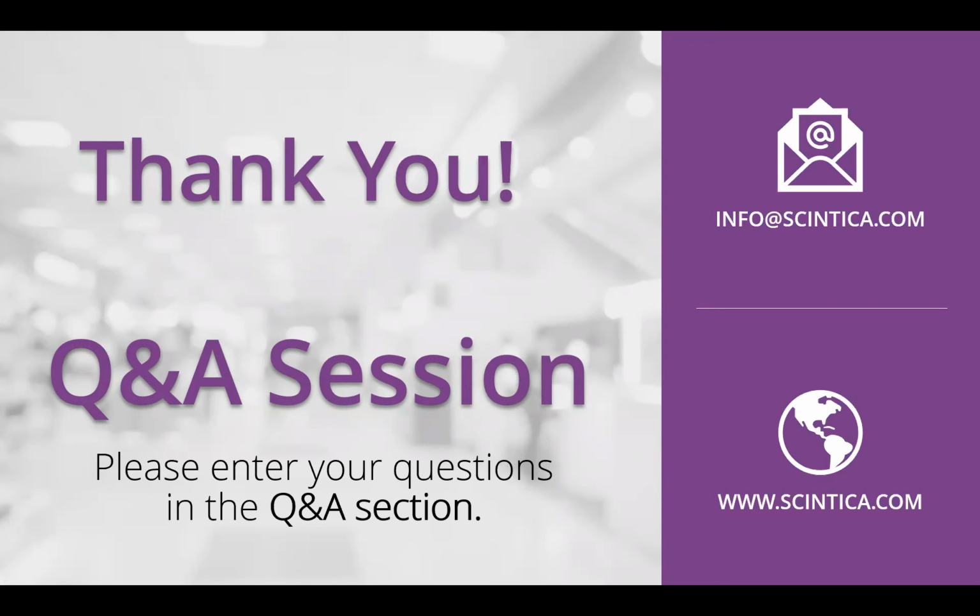Thanks, Tanya. We have time for one more question, and it's the following. You showed that a window chamber is used for intravital microscopy. I want to study the changes in the inflammatory response over a few days or maybe a week. Could I do that? Great question.